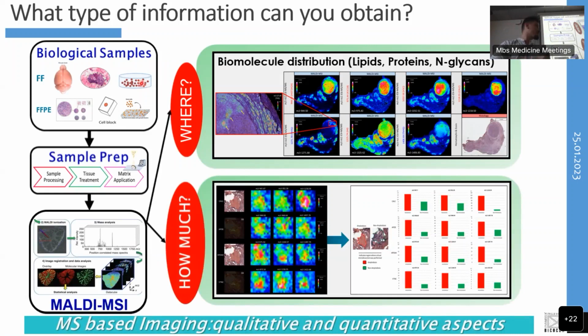So one thing that I can specify as well, that why this technology has become so popular, is that it can be applied to a wide range of different samples. So both fresh frozen tissue samples, cytological samples, and now as well as formalin fixed paraffin embedded samples. And now with the help of more complex tissue preparation processes, which take advantage of on-tissue chemistry that are becoming more and more reproducible, it is becoming more appropriate in multicentric studies.